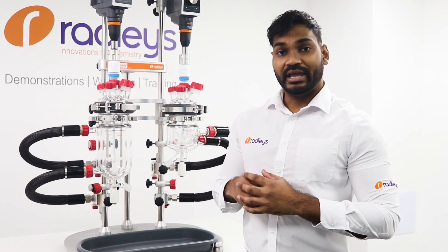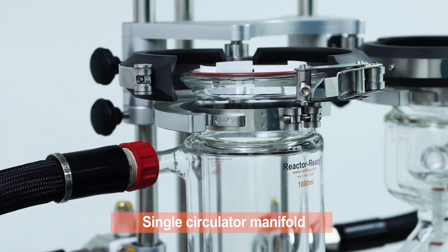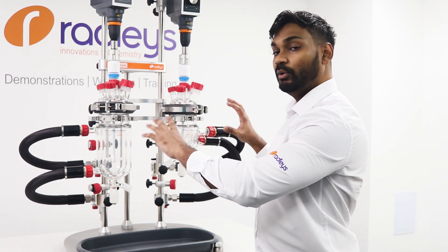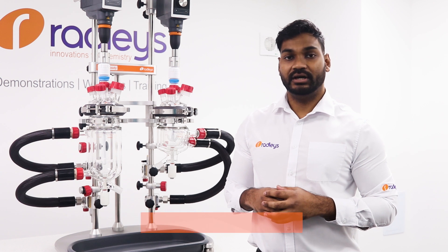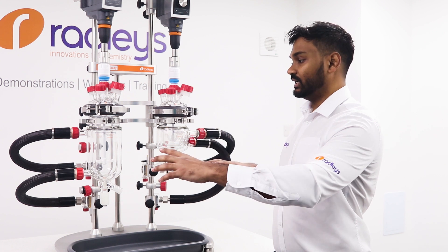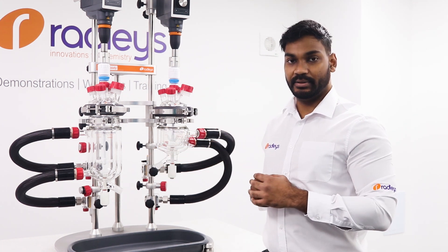On Reactor Ready Duo you're able to choose between a single circulator manifold system, which allows you to connect one circulator controlling the temperature of both vessels simultaneously. Alternatively, you can have a double circulator manifold system, as we have here, which allows you to have one circulator per vessel controlling the temperature of each vessel independently.